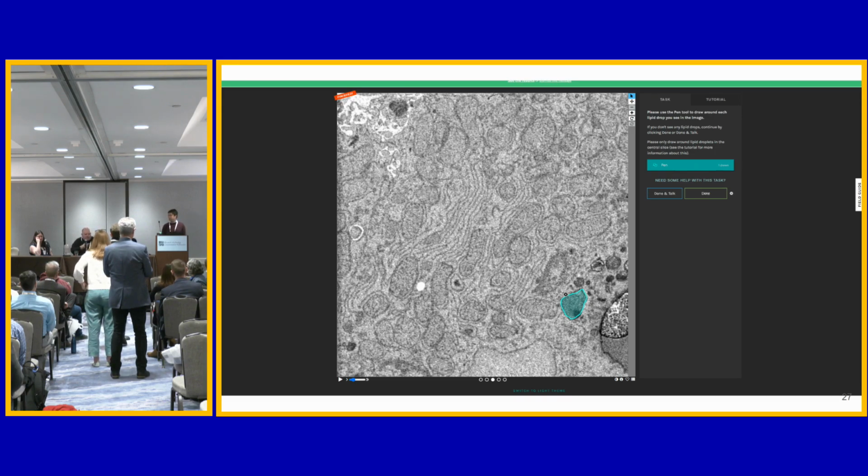Yeah, I think maybe to echo Thomas's point, maybe the best thing is to see if someone's already done it. If you're a core trying something for the first time on a unique, novel data set, it might be harder. But if it's something that has already been published and is very similar, it's a much easier entree. So when someone comes to you for help, if you can see that someone else has done something similar, then it's a much easier on-ramp.